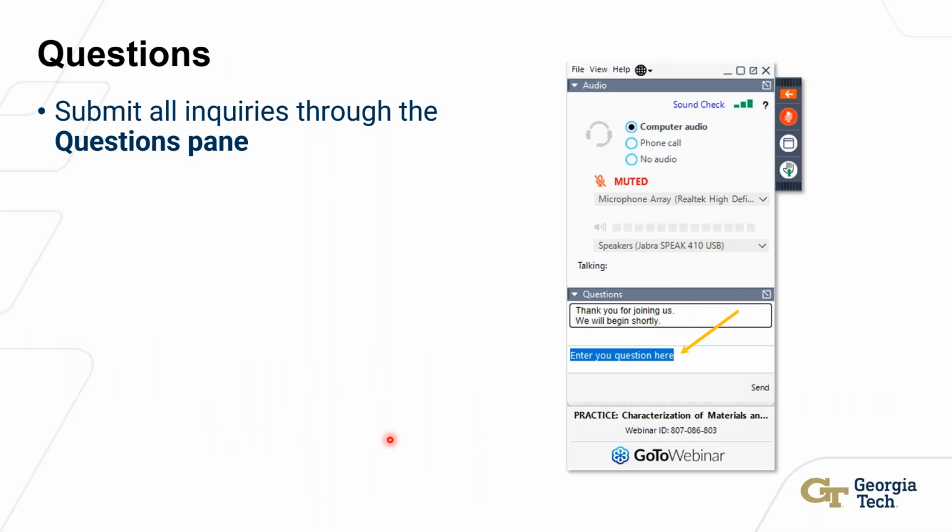Another question, a couple of people have asked about what happens when you have multiple different grains through the thickness of your material. If the grains are overlapped, what happens there? Yeah, so if you have too much overlap of different grains, then you're just not able anymore to reliably index the diffraction pattern.